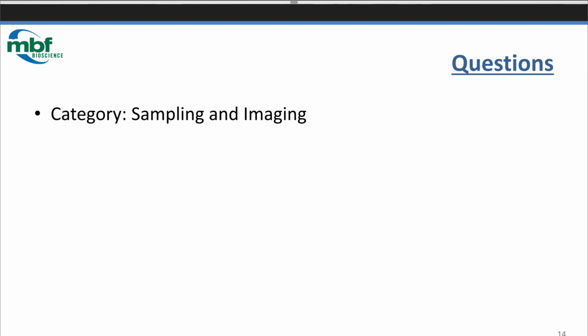Alicia Flores is thanking us for answering her question about MRI. They use fluorescent samples to use area fractionator. They have mono images, black and white images, and the question is it possible to add color to each marker? It sounds to me that if your markers are black and white, you may be running the program in mono mode. So that should be a routine thing to get colors on those markers.